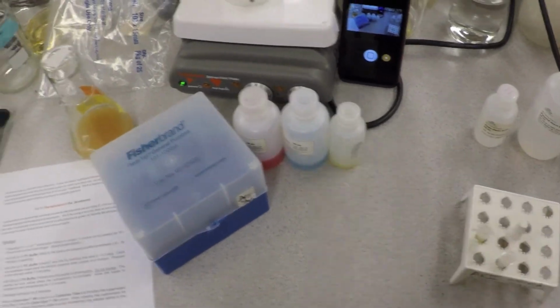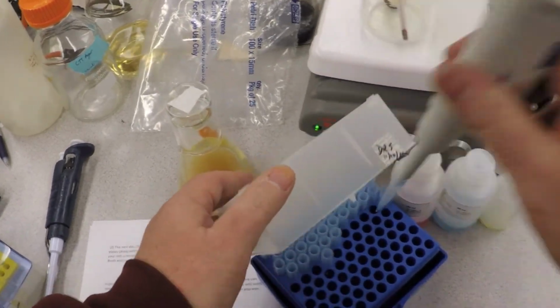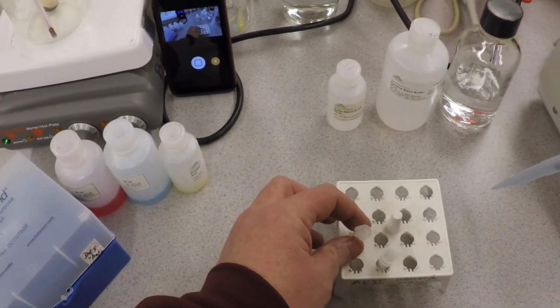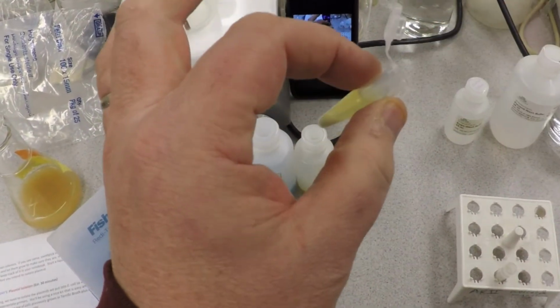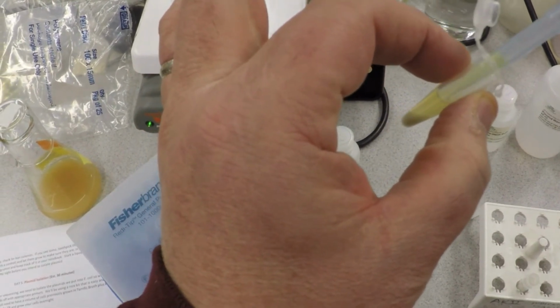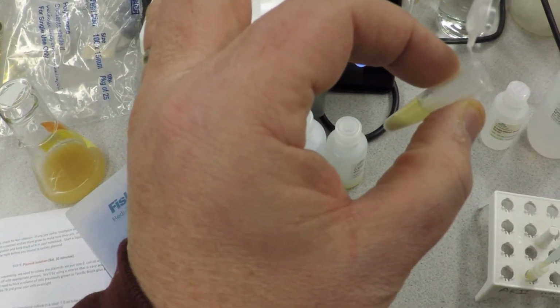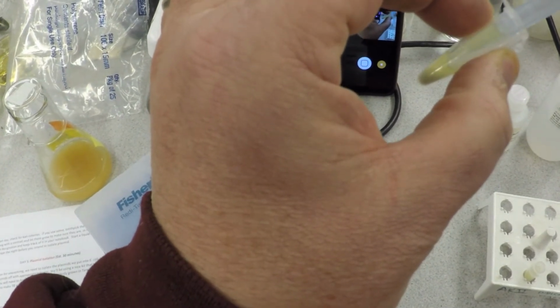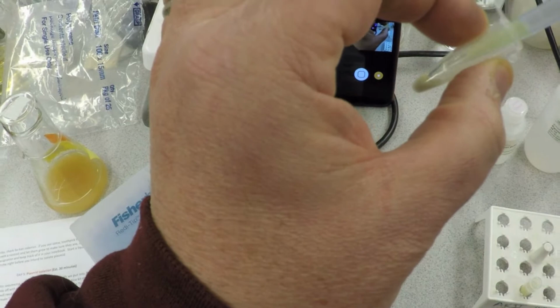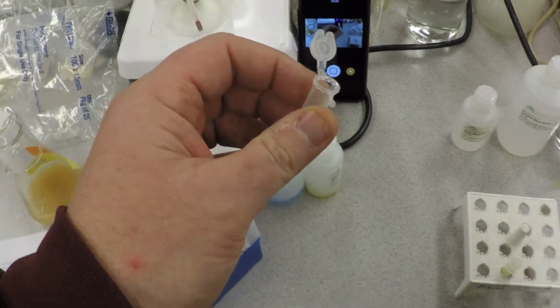And the only watchword here is that, depending on your organism, this can be a tricky step just because you don't want to pick up any goobery stuff. You want to just get the liquid up here. So you start pulling up liquid, and as you get to the bottom, things can get a little dicey on you. Because as you pick this up, I hope this works. I lucked out. I had no problems picking up, I didn't pick up anything extra, which is great.